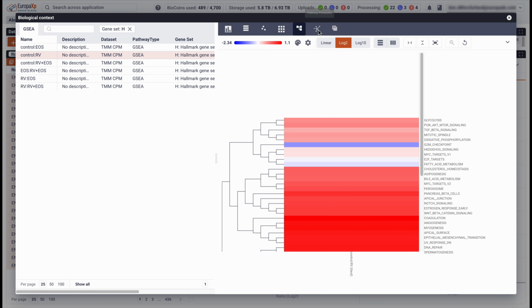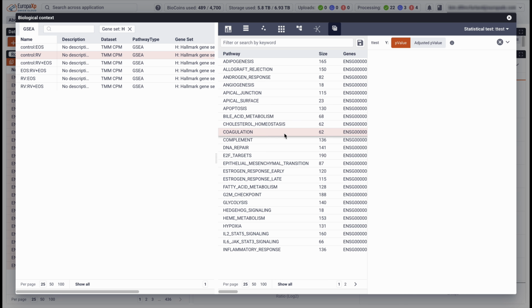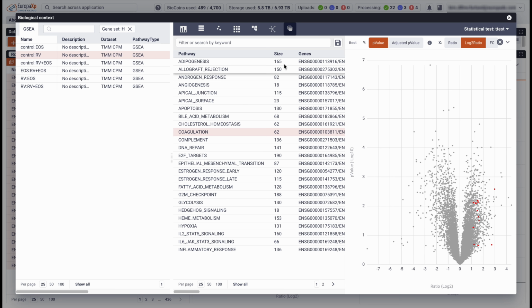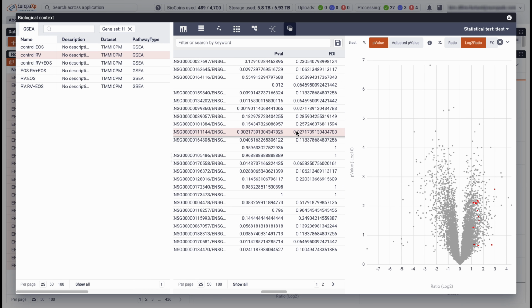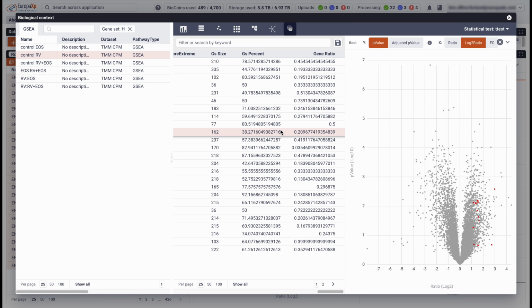If we ran reactome pathways, we could also view that here. The final option is to view the results table, where we have a list of the leading edge genes and the other results. Here, or in any plot, we can select a gene set to see a highlighted volcano plot where the colored dots show the leading edge genes. Again, take note of the order of the selected groups so that the ratios make sense.